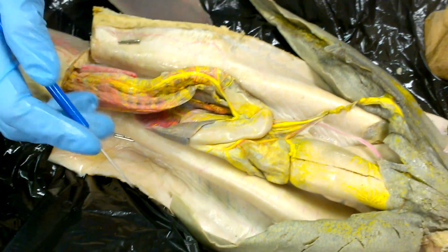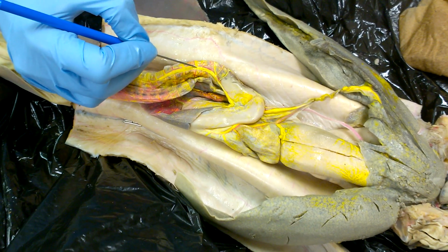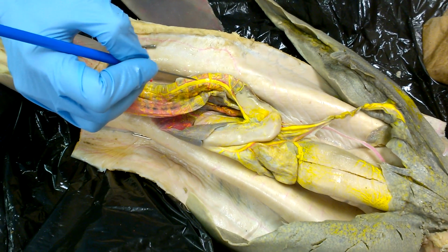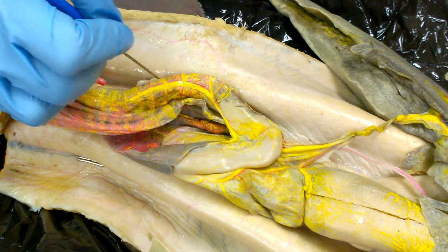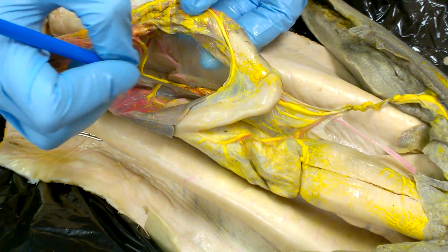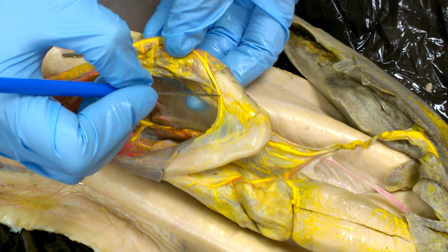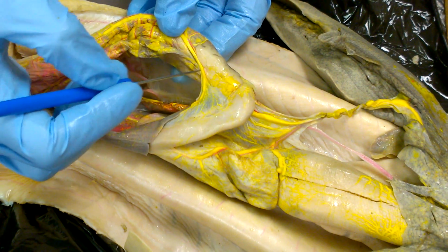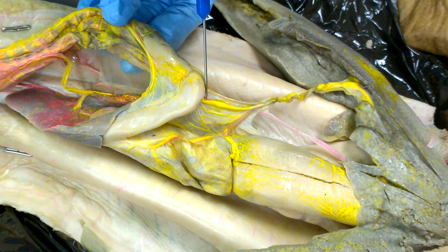So then, on the front part of the intestine, we've got more of these ones that wrap around. Annular veins. Perfect. And they empty into the anterior intestinal vein. Outstanding, which comes up and joins this one that drains the front half of the spleen. The anterior splenic vein. Great. So those come together to make the pancreatico-mesenteric vein, which is right here next to the artery.